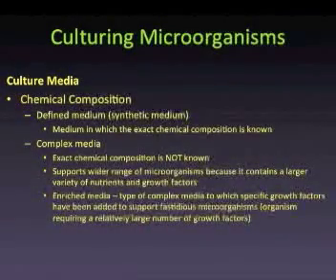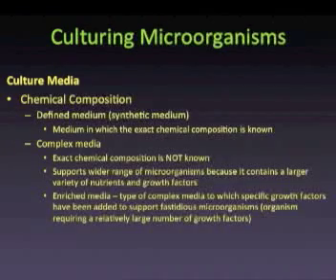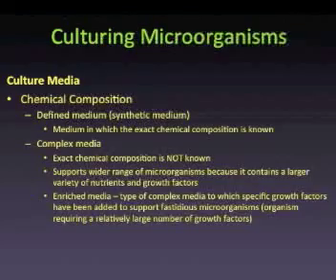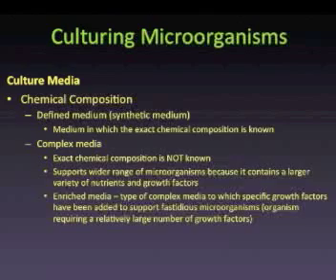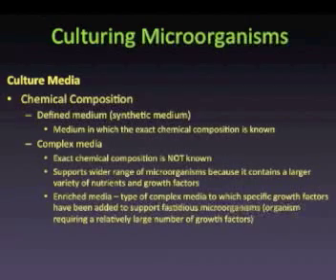Media can be classified based on their chemical makeup into two types: synthetic or defined media and complex media. Synthetic or defined media contain ingredients of definite chemical composition. In other words, you would basically be able to count the number of atoms of each representative element present in the media. Defined media are used primarily in research because the results of microbial action on the media are comparable between labs, even if they are labs that are thousands of miles away. This is because the chemical makeup of the media is exactly the same.